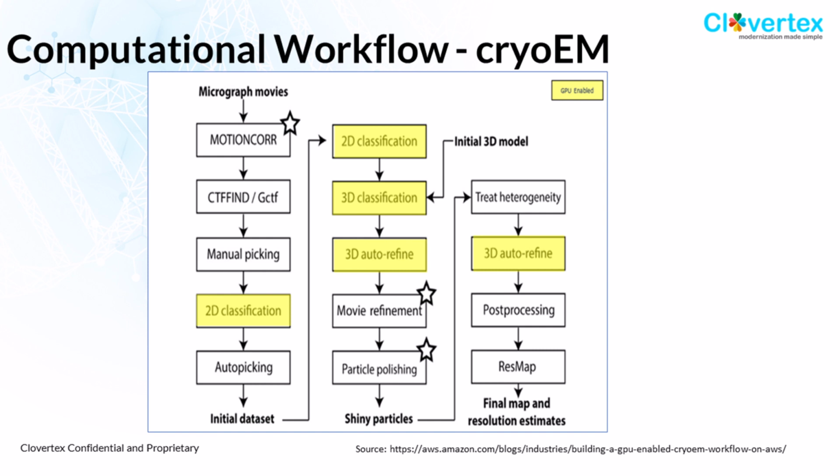And each algorithm does a very different image processing task. And so cryo-EM is one of the methods where the computational part is very heavy, especially compared with X-ray crystallography and NMR.